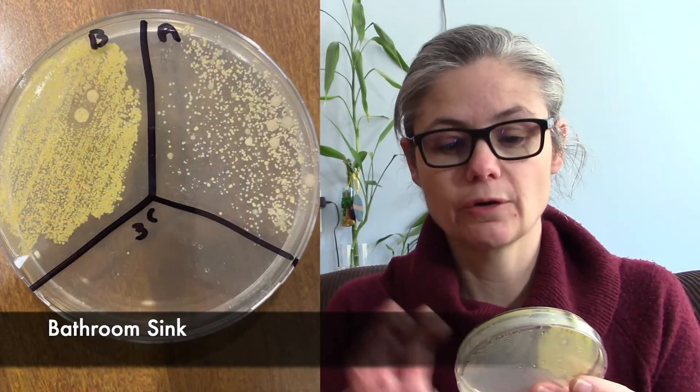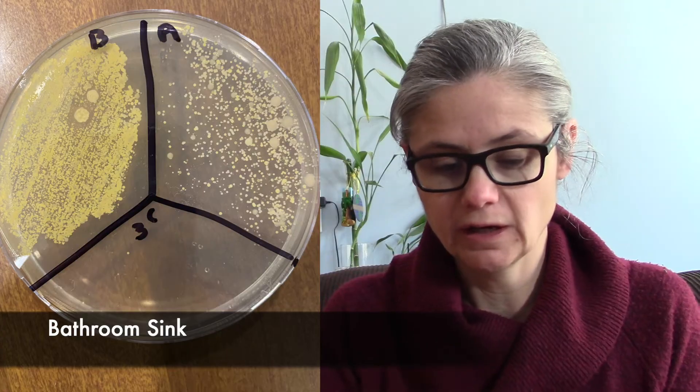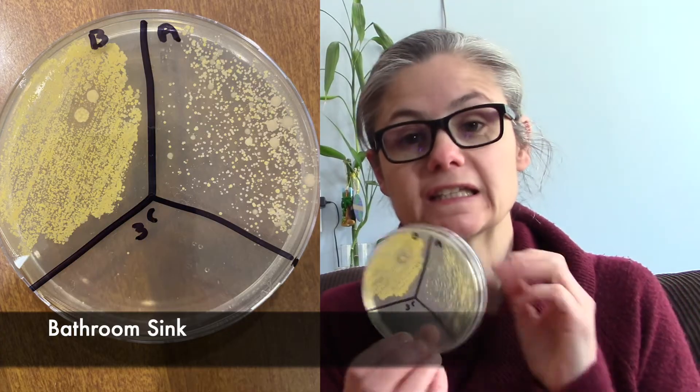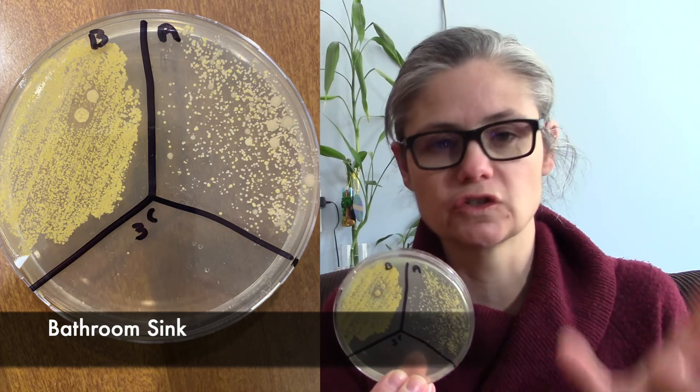How did it do in the bathroom? My bathroom sink — so this one we can see the B for before. Lots of bacteria there. Some really small yellow colonies as well as a couple of big guys. And the A for after, you can see a decrease. There is a decrease, but it is not hugely significant. So I would say it did a so-so job at disinfecting my bathroom sink.